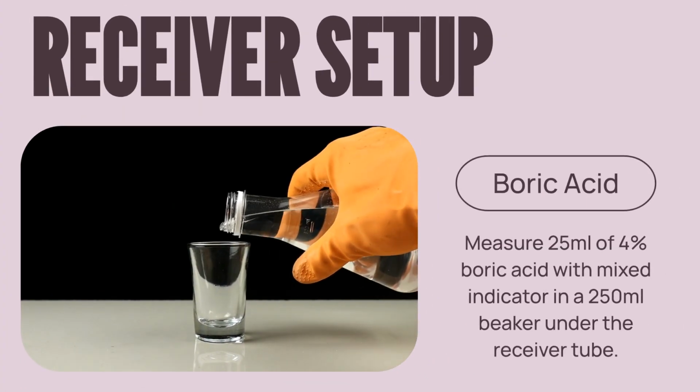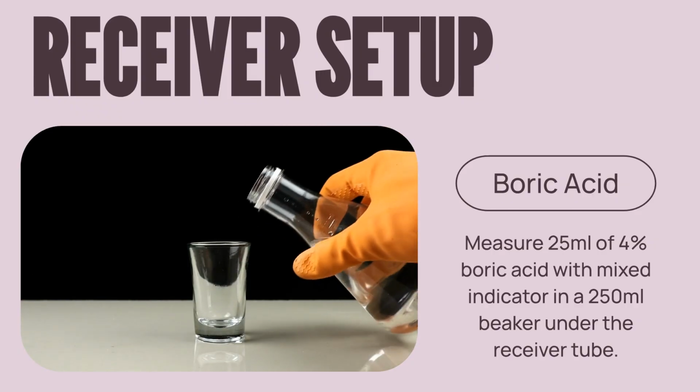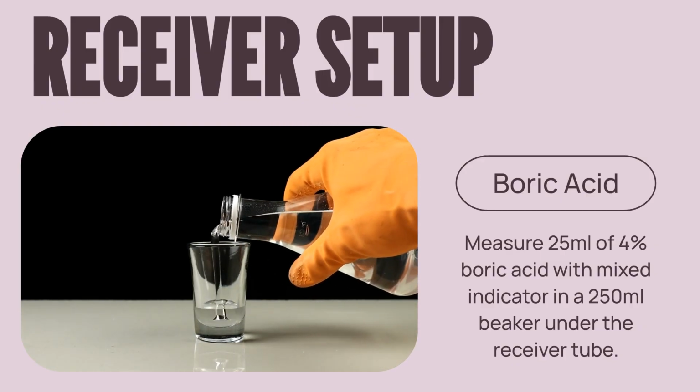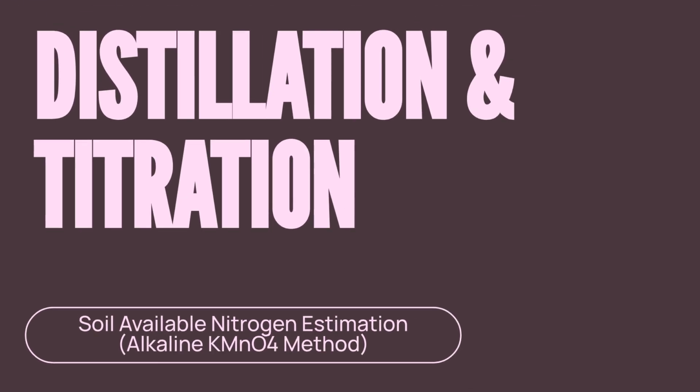Measure 25 milliliters of 4% boric acid containing the mixed indicator into a 250 milliliter beaker. Place this beaker under the receiver tube, ensuring the tube end is dipped into the boric acid solution to capture the ammonia. Now we move to the core stages of the process, distillation and titration.